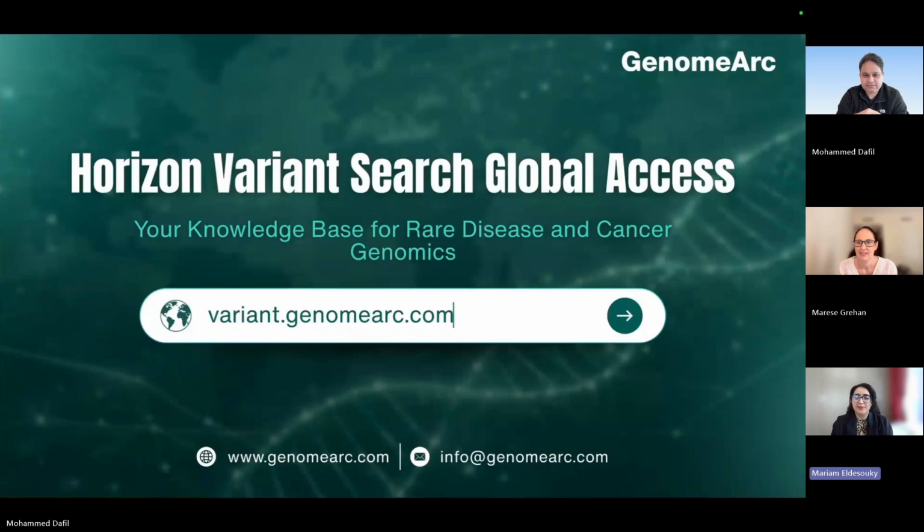Everybody, and welcome. Today, we will be introducing a very exciting initiative that we've started recently, Horizon Variant Search. We've opened it for global access, and it will be a huge knowledge base for both rare disease and cancer.